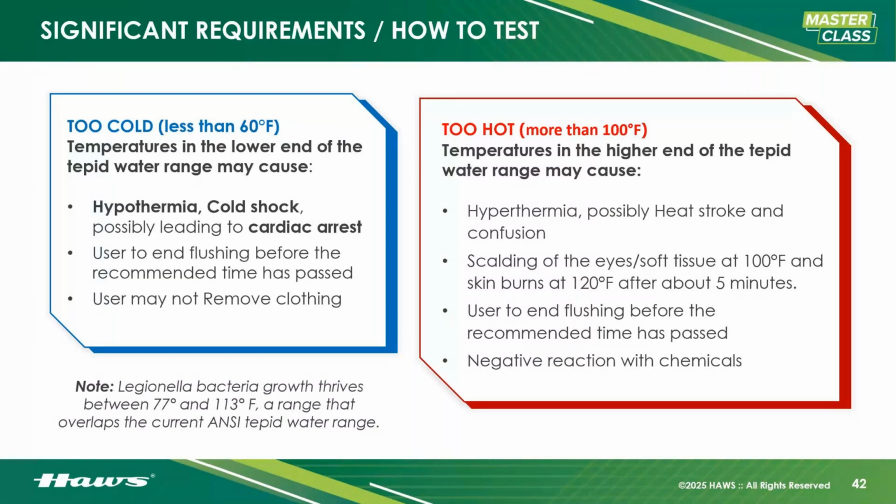It's crazy. But hyperthermia, we're heating up too quickly, which will cause confusion and heat stroke. And you need to be able to communicate clearly what were you exposed to, how long were you exposed to it, and other important medical information that you need to be able to relay. It may force you out of the shower too early, and that hot can react negatively with certain chemicals.